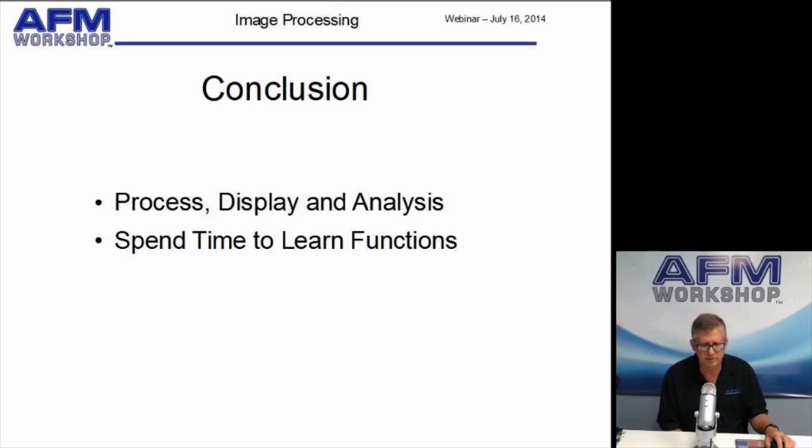Okay, there's some more questions. I'm very new to AFM, so I apologize if this question has a very obvious answer. What is the purpose of three-point leveling? What information is retrieved? Well, three-point leveling is a good technique for specific kinds of samples that have multiple levels in them. Quite often, samples like terraces, atomic terraces, or images of semiconductor device structures with many levels, they don't level well with planar polynomial leveling or line leveling. So three-point level can be very good for those kinds of images.